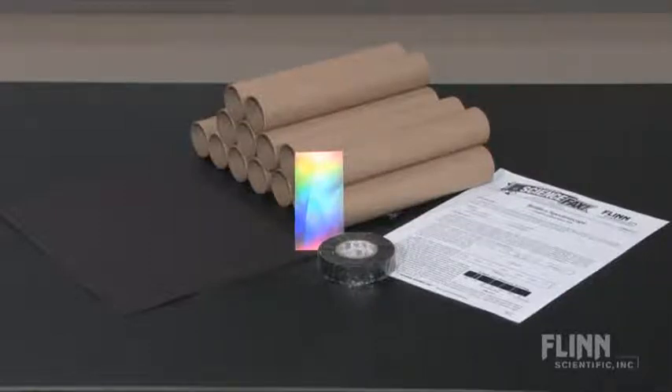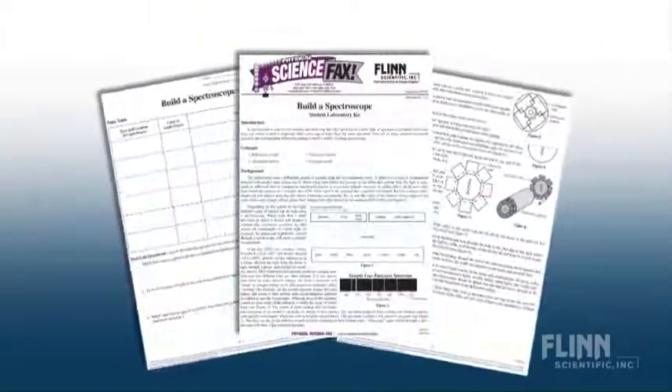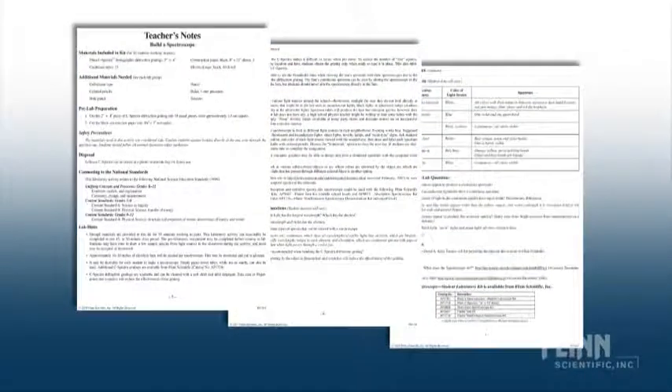Flynn's Build a Spectroscope Kit comes with all the necessary materials to construct 15 spectroscopes, reproducible student handouts with easy-to-follow directions, as well as comprehensive teacher notes that provide valuable tips and safety precautions.